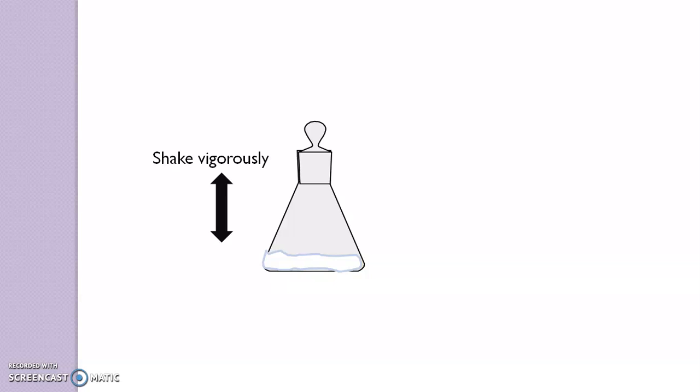When the reaction is complete, that is when the odor of benzoyl chloride can no longer be detected, okay, meaning there is no smell of benzoyl chloride, this indicates the reaction is completed. After that you have to dilute with 10 ml of water and then filter the product with suction on a small Buchner funnel and you will get the solid compound, white color solids.